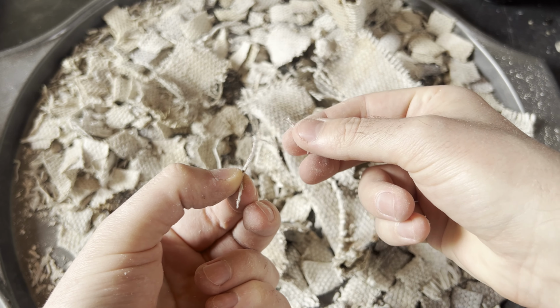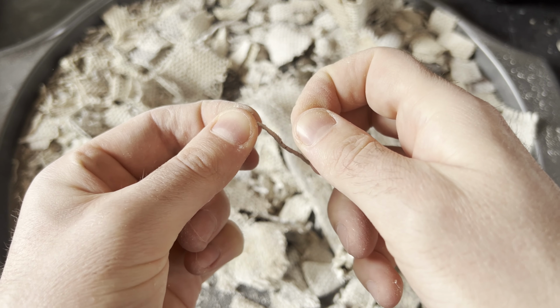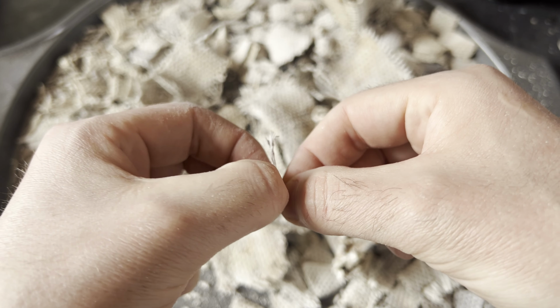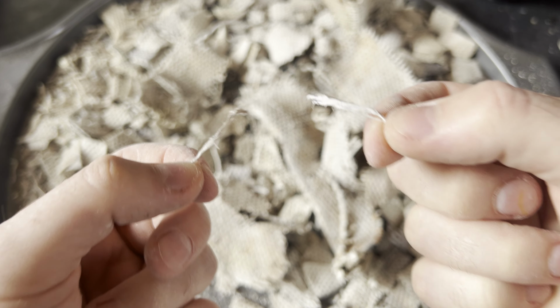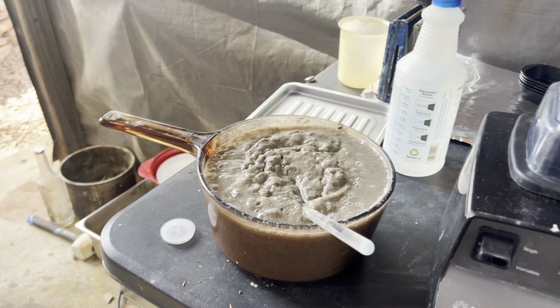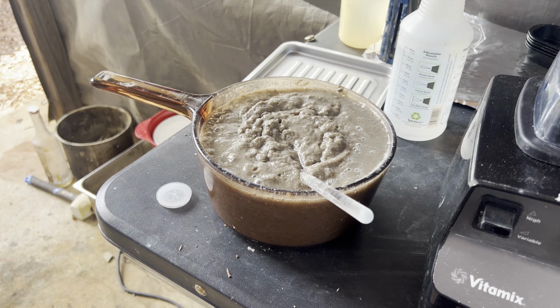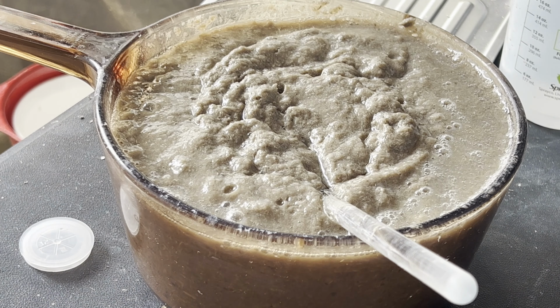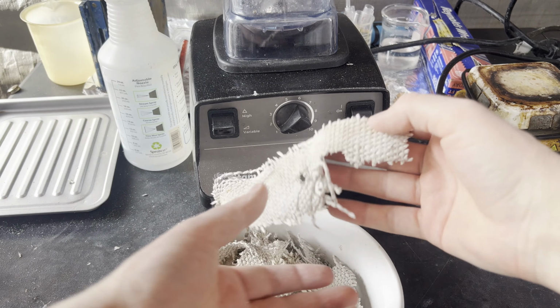For perspective, several articles and a few books that I've read, I think when preparing ultra-pure water or sulfuric acid, nitric acid, hydrofluoric acid, even hydrazine and other things, say to use a platinum distillation apparatus, which is nuts. It's nuts because of how expensive it is, but if you look at copper stills for moonshine or alcohol or whatever, it's one of those, much thinner, made out of platinum. Okay, back to platinum Gooch.